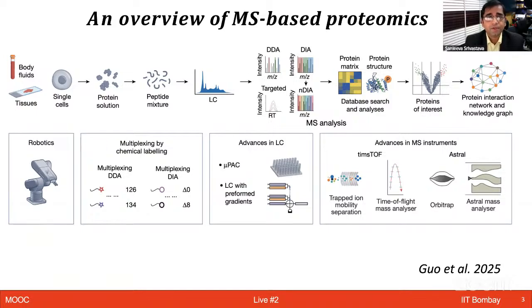This entire trajectory of changing the field of proteomics, reaching the field of shotgun proteomics, was all happening in the 1998 or 2000 kind of years. That's the time when 2D gel and the field of DIGE was getting developed. And then people realized how challenging it is to get good quantification data from the gels, because of the reproducibility issue that we have been discussing in the course. It's not very easy to do high throughput proteomics on the gel.